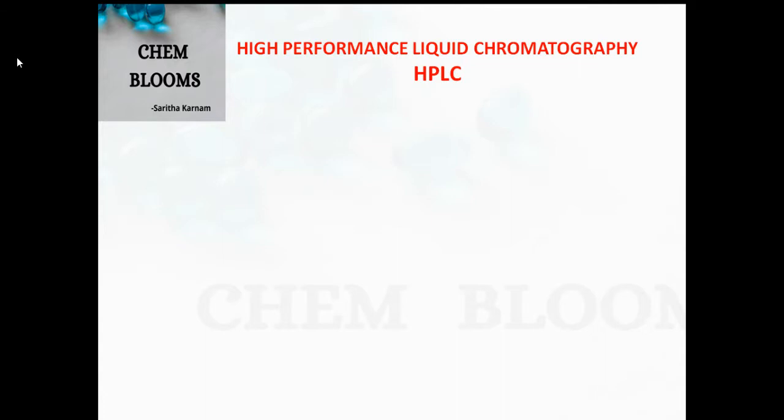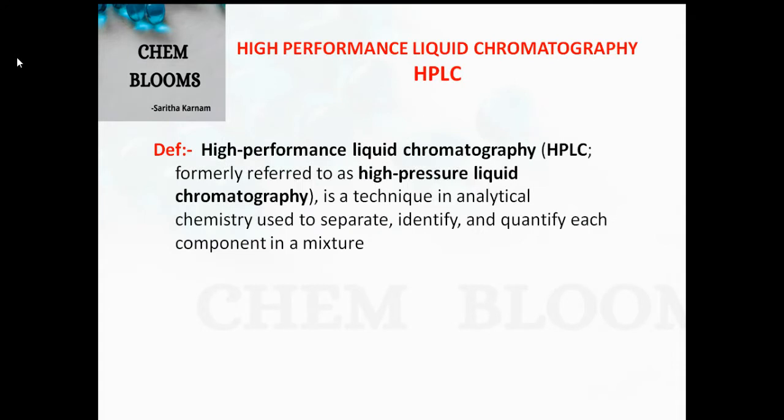Today let us learn about one of the most important techniques in chromatography, that is HPLC. HPLC stands for High Performance Liquid Chromatography. It is also referred to as High Pressure Liquid Chromatography. This is the technique which we can use to separate, identify and quantify the components present in the mixture.